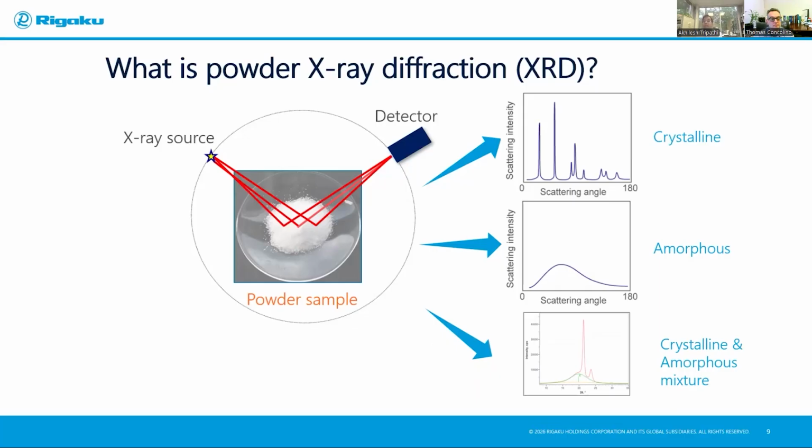It has some degree of molecular order, but not a long-range order. And it retains the fluidity like an amorphous material. I also want to mention today that our x-axis usually in the cases is scattering angle 2 theta or d spacing, and our y-axis is scattering intensity, usually raw counts or counts per second.